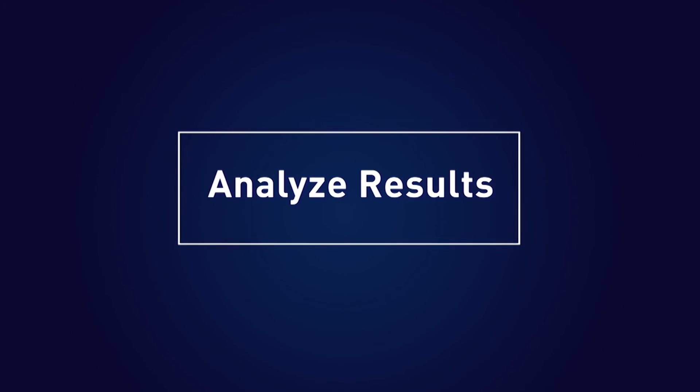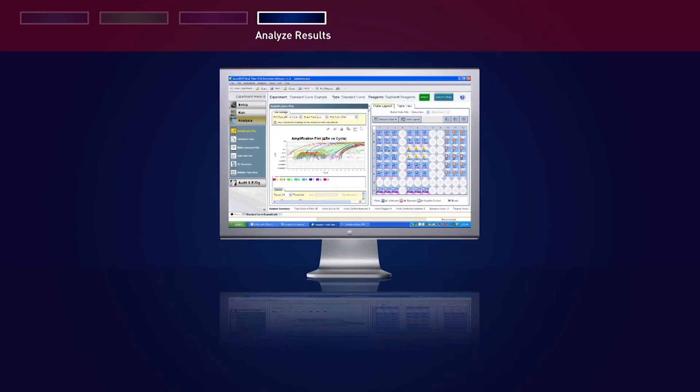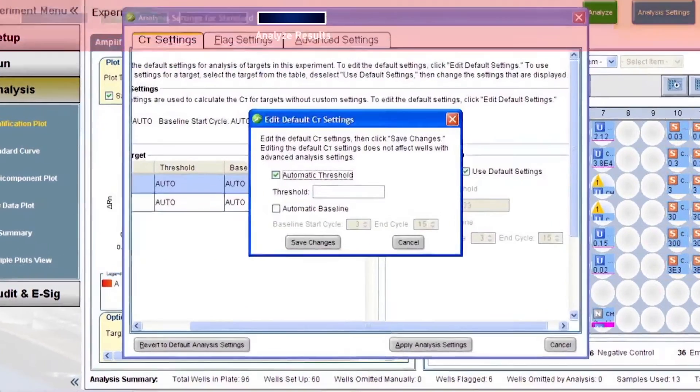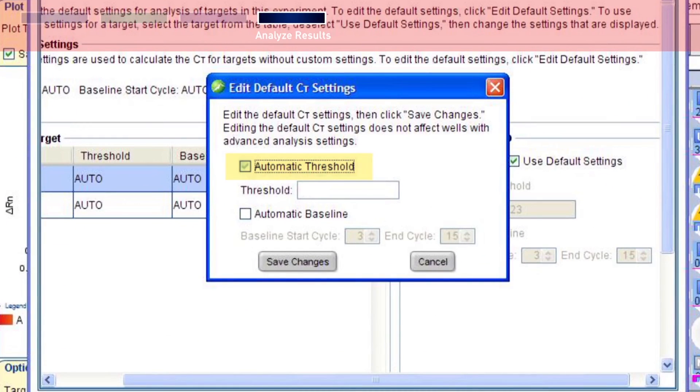The final step in this protocol is analyze results. In the AccuSeek software, select the following analysis settings. In the analysis settings window, deselect Automatic Threshold. In the threshold field, enter 0.2. Baseline may be run in automatic or manual mode, whichever mode best suits your data. Evaluate first with auto baseline by selecting Automatic Baseline.